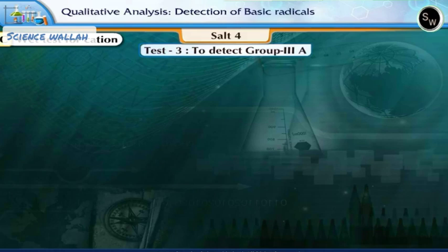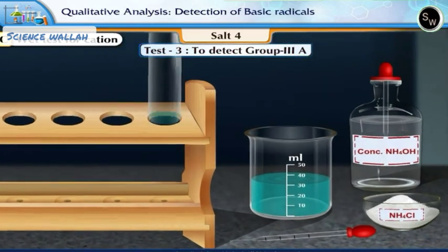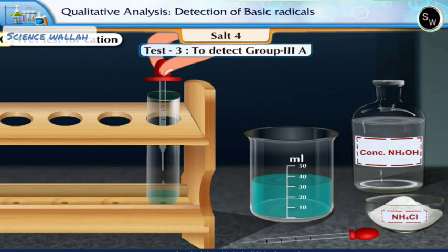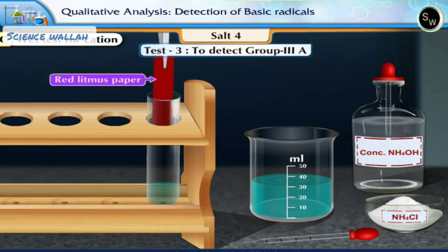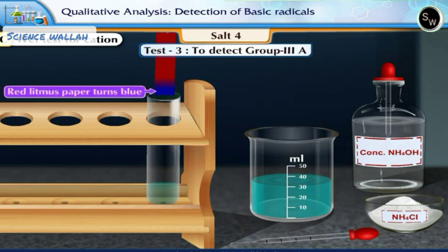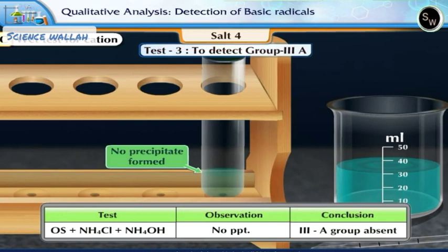Test 3: To detect group 3A. Take about 3 to 4 drops of the original solution in a clean test tube. Add a pinch of solid ammonium chloride, then add concentrated ammonium hydroxide solution till alkaline. Test the solution with red litmus paper. The paper turns blue, indicating that the solution has turned alkaline. There is no precipitate formed. This shows that group 3A is absent.